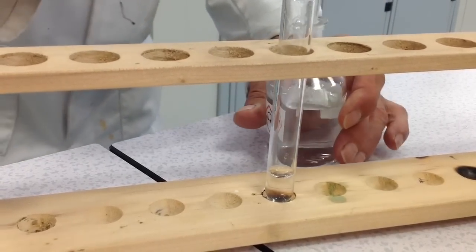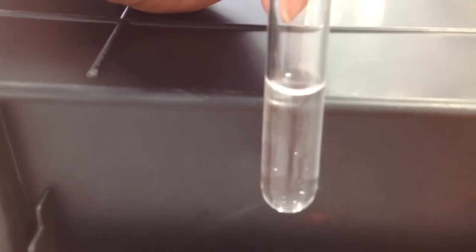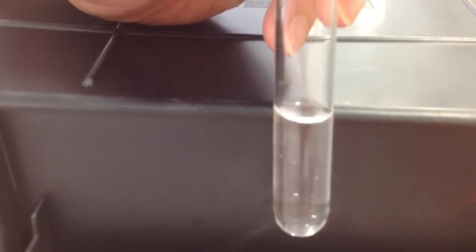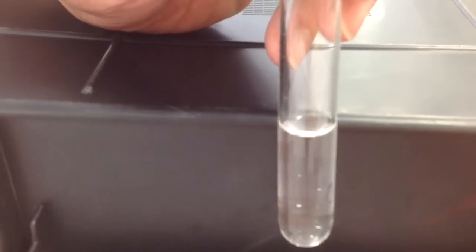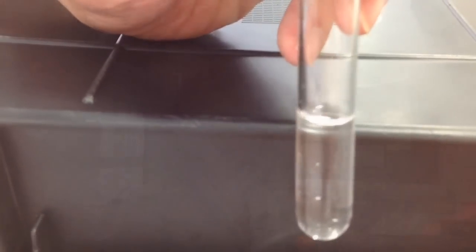Before I do this, I'm actually going to move the test tube in front of a black area so you get a better view. Now pay attention. There we go. Now you should have seen effervescence being given off. This is carbon dioxide gas being given off. Now this can happen very quickly, so it's important to pay attention, otherwise you might miss this.